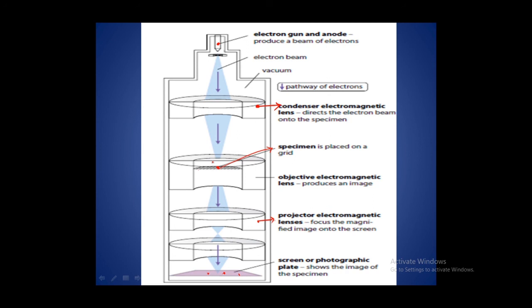Okay, also some of the time scientists use false color images using computers. They use it in order to color a standard black and white picture which is observed on a photographic plate. They just make it colored so that we will be able to differentiate different organelles. Say we are observing the cell and cell organelles, we will be able to observe the different organelles better if we color them. So that can be done using false color images.